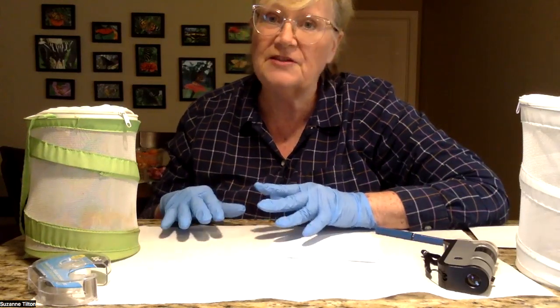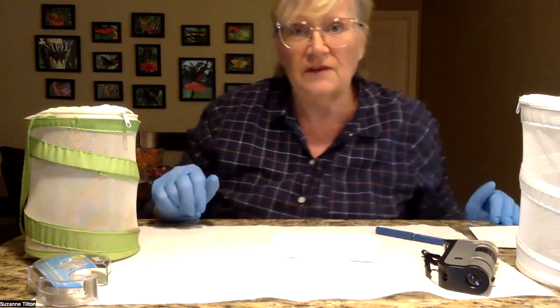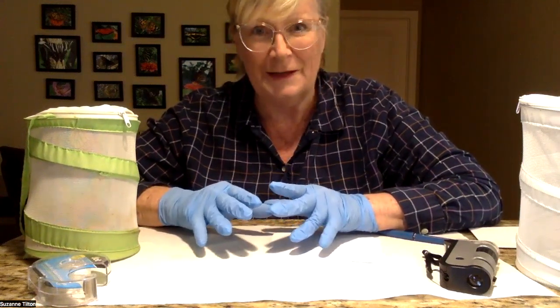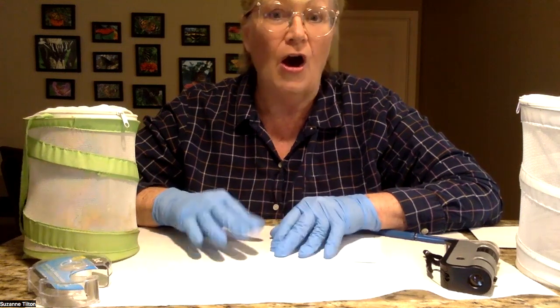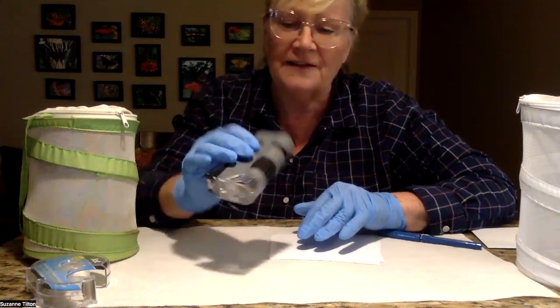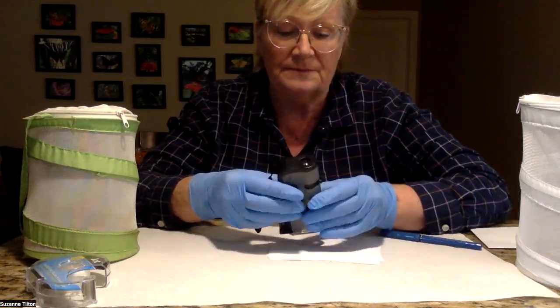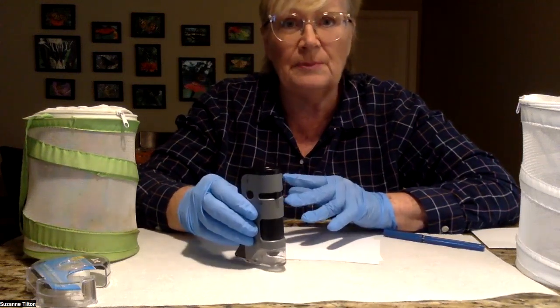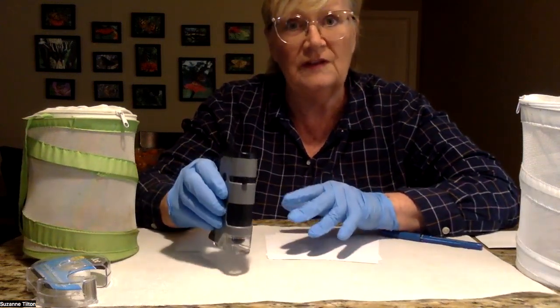So if you live in areas, especially in Florida, South Texas, or along the Gulf Coast where OE is prevalent, you probably want to learn how to do this. Initially I was very intimidated about this process, but I want to show you exactly how easy it is. All you need is a little, very inexpensive microscope — you can find these on Amazon. It has to magnify at least 40 times, but better if it magnifies at least a hundred. This one goes up to 150 so you can see the OE spores.